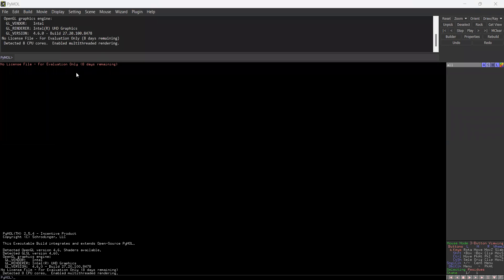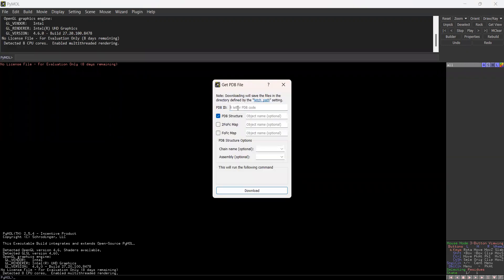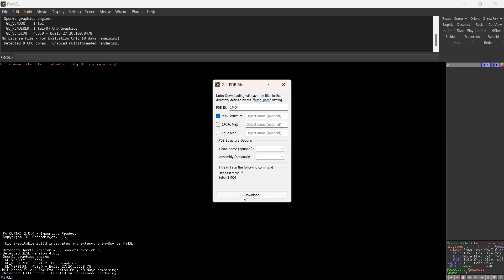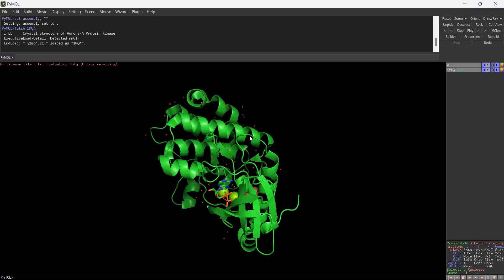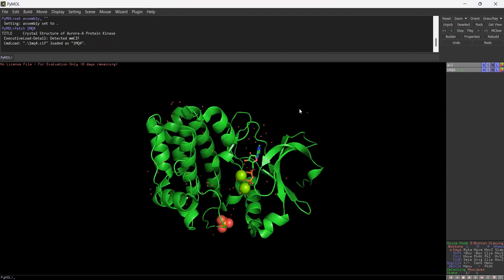You can go with respect to the File menu and directly get the PDB, or else you can even open a particular PDB file which is available on your system if you have done the docking. Right now I'm going to get the PDB — you can search for the PDB four-letter code, go with any PDB ID. Once you enter the PDB ID you just click on Download. Here you can see that the complex structure of protein and ligand has been downloaded into PyMOL.